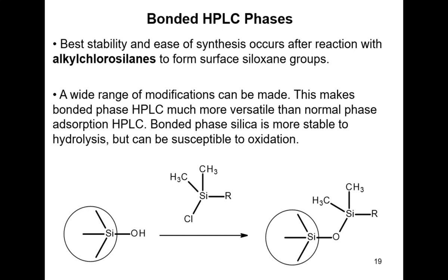What's happening during the reaction is that an oxygen atom on the surface of the silica replaces the chlorine, and you generate this additional silicon linkage, but the process stops there because the alkyl groups on that extra silicon are now unreactive. So it's quite an efficient way to cover the surface of the silica particles by modifying these OH groups.